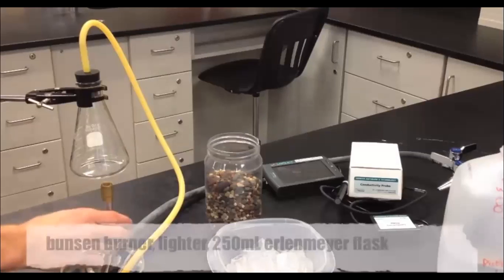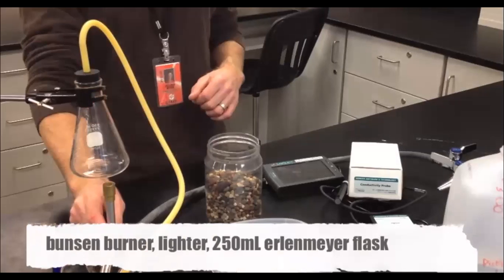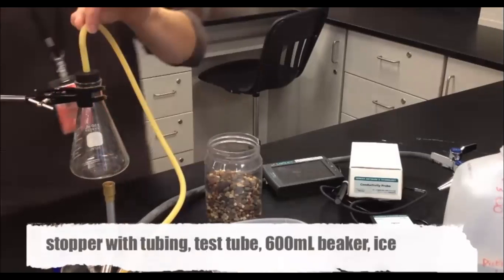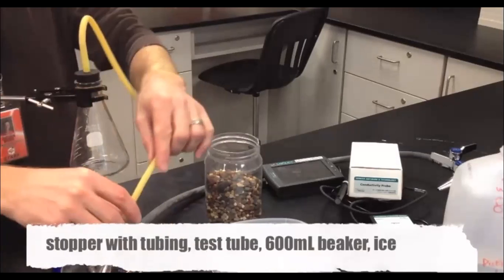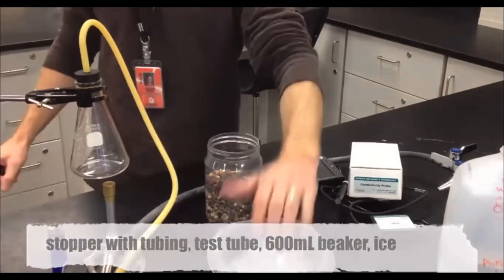We're going to need a Bunsen burner for this lab. We're going to need obviously a lighter to start the Bunsen burner. You'll need a 250 milliliter Erlenmeyer flask with a rubber stopper and a tube coming out of it that's going to collect the steam. And you're going to need a test tube in order to condense the steam into liquid water. You'll need a 600 milliliter beaker, some ice, a couple boiling chips or rocks, a LabQuest device, and a conductivity probe to measure how much salt is in the water. And of course you'll need salt water in order to run this experiment as well.